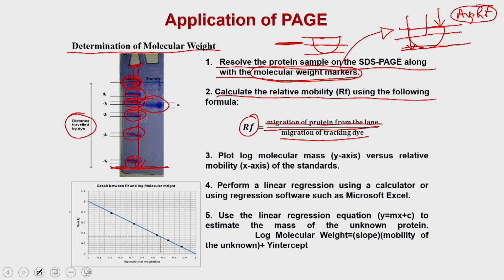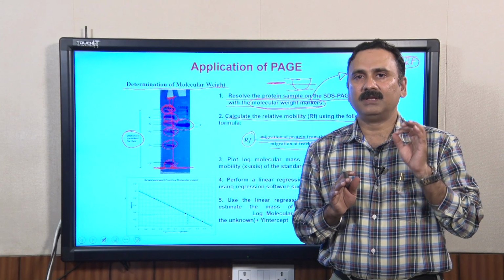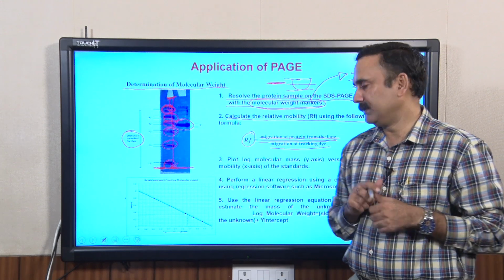That is why it is recommended that you load a very little amount of protein, so that it just forms a very thin line or thin band on the SDS-PAGE.